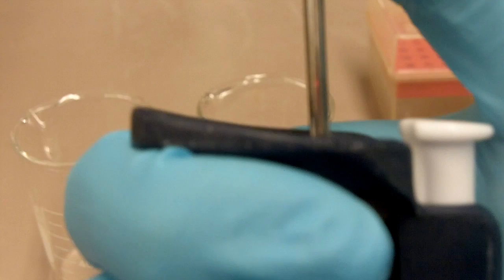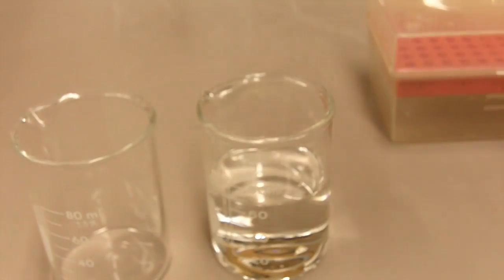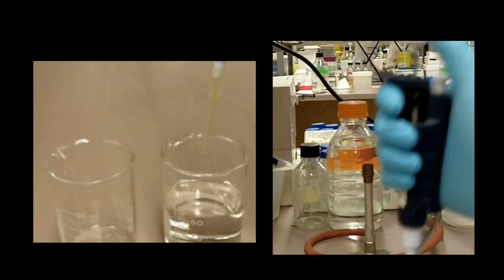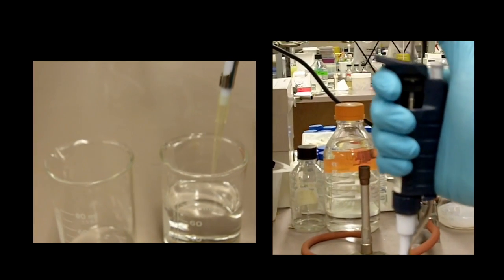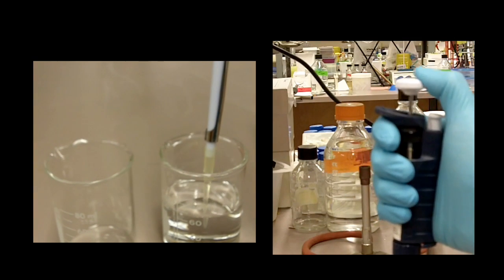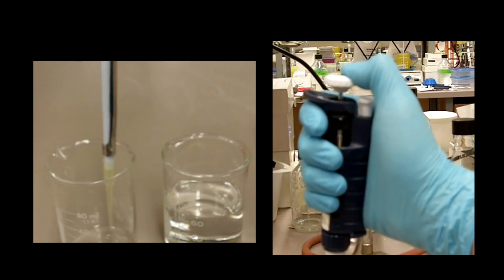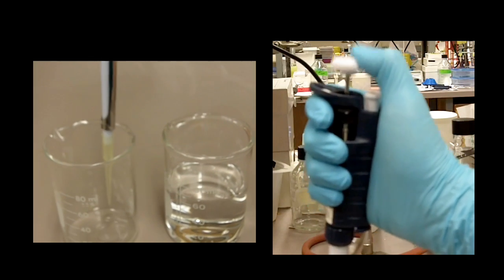So again, when you withdraw solution, you go to the first stop and you stop. When you expel the solution, you go to the second stop. So you press it to the first stop first, insert the tip into the solution, release the plunger, and then when you expel, you go to the first stop and then go to the second stop to expel everything.